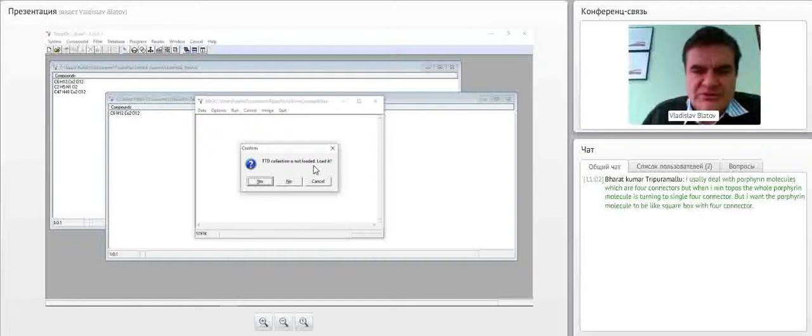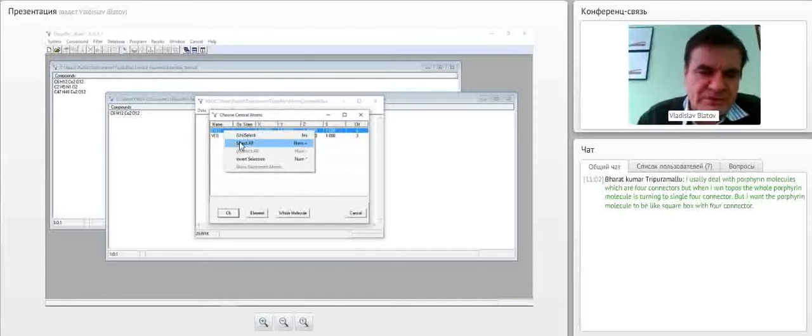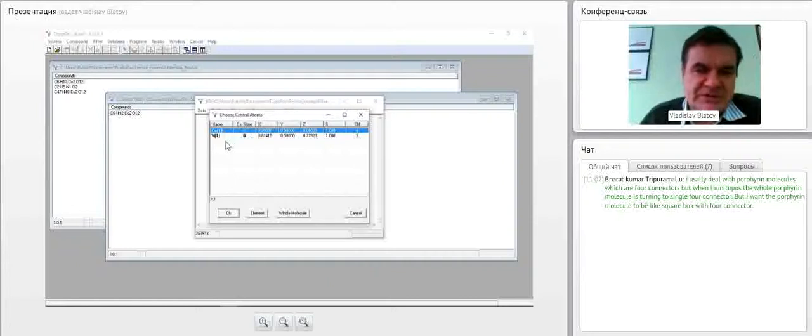So now we use the standard collection that you have, I think, on your computers. I download it. I have now to select all atoms in the list because I analyze the whole network. I determine the topology of the whole network, or the network of metal centers and ligands.